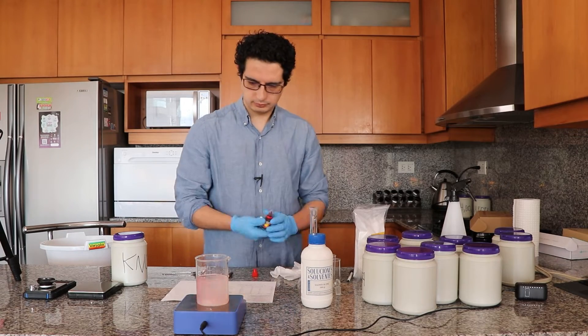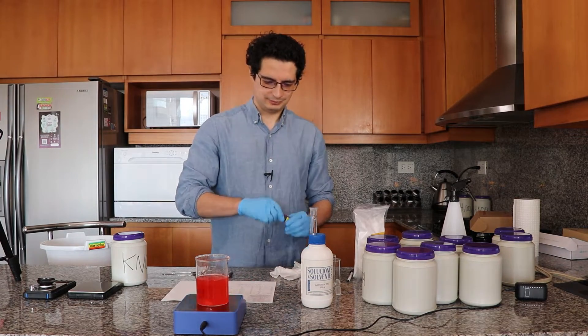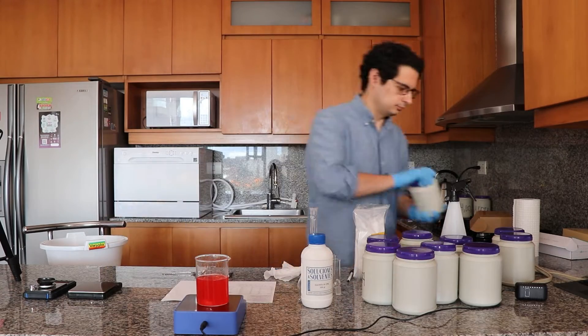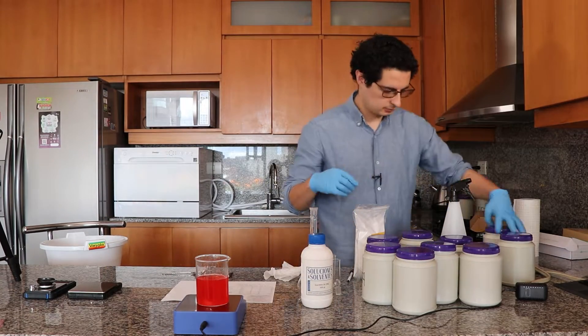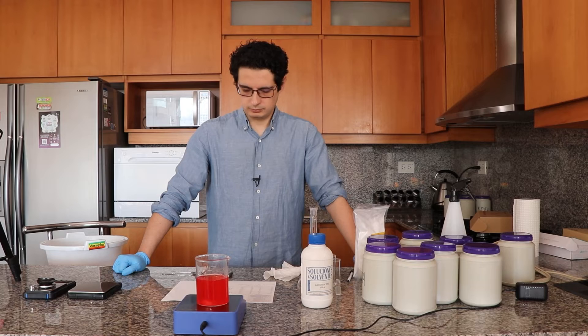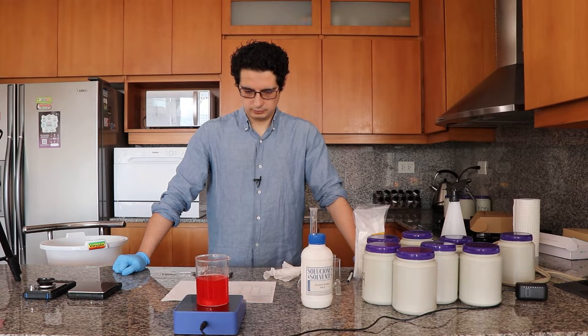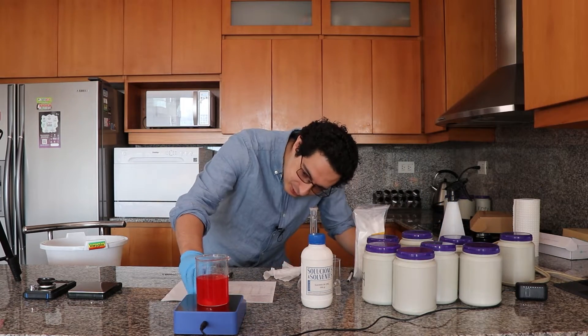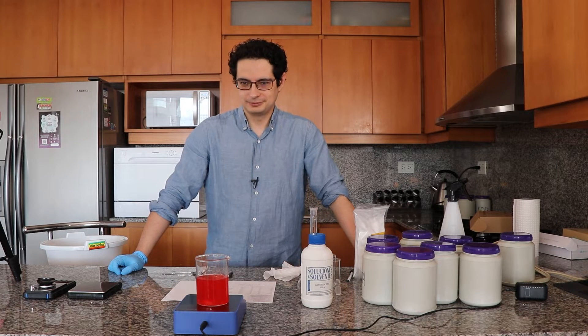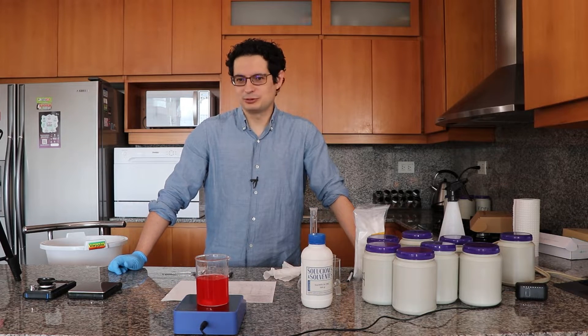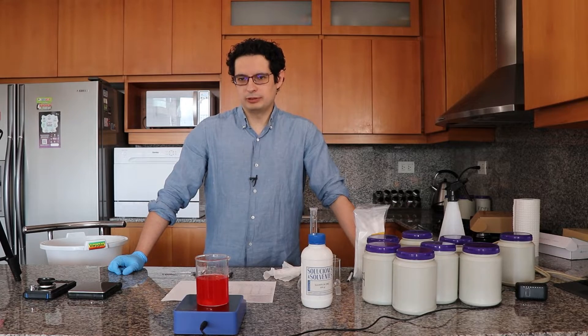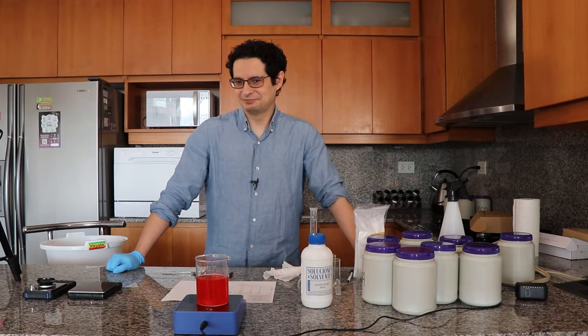Now I'm adding a little bit of dye to give the solution some color. Usually you only need a small drop to have a very intense color, so don't go crazy with the dye. Now after I confirm that everything has been fully dissolved, I will then fill the volumetric flask with this solution.